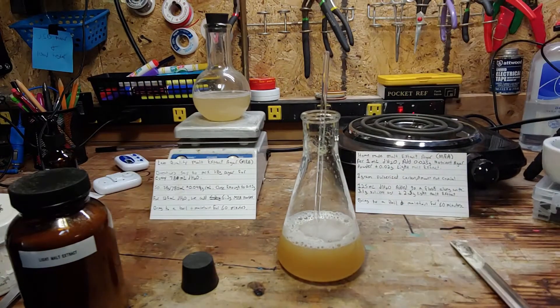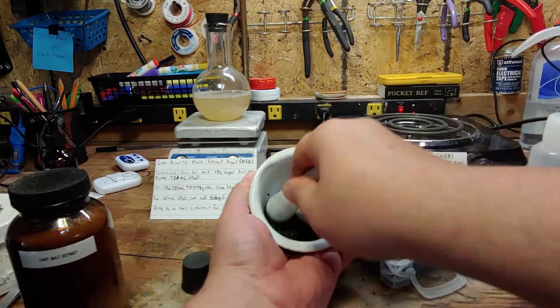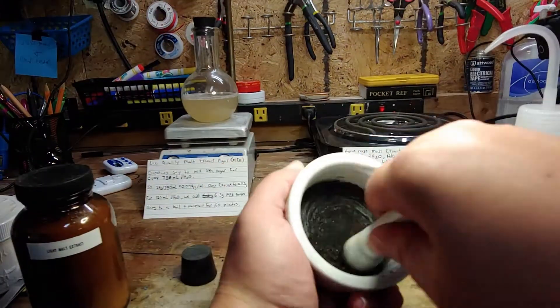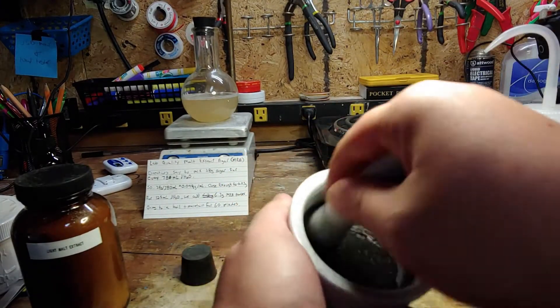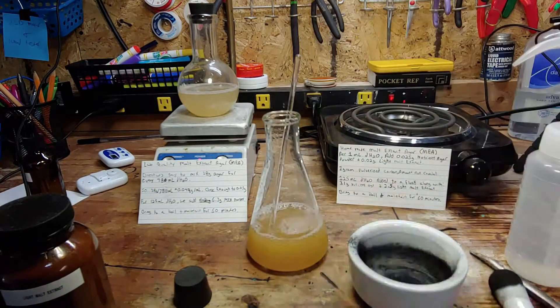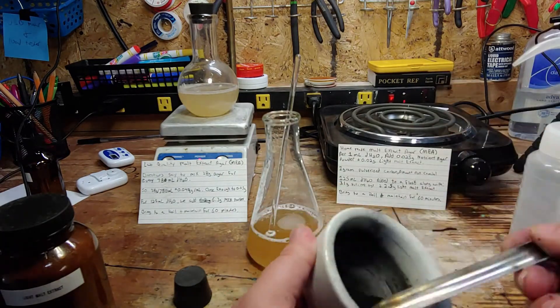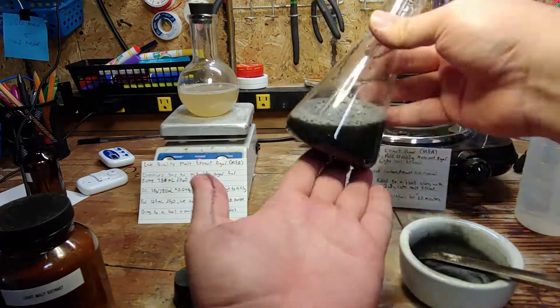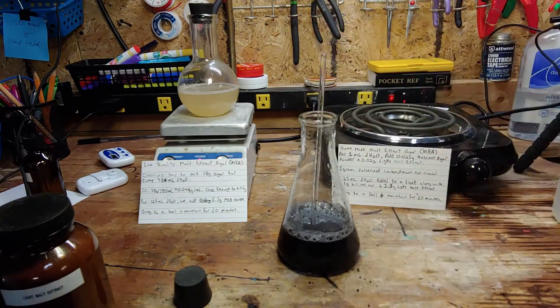Grab the mortar and pestle along with the activated carbon. Transfer some carbon into the mortar — the exact amount isn't crucial. This needs to be pulverized into as fine a powder as possible, so we crush and crush and crush. Start adding the carbon to our agar solution, and stir until a very black mixture is obtained. More on the use of carbon shortly. Wash down the sides of the flask, and then place on the burner.